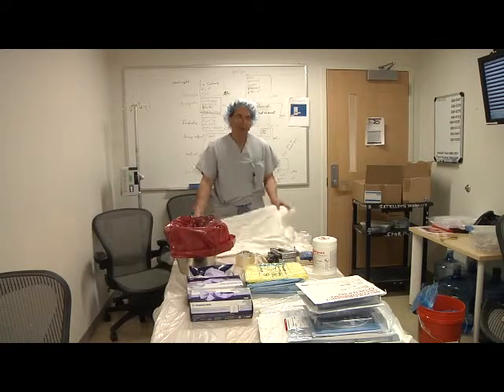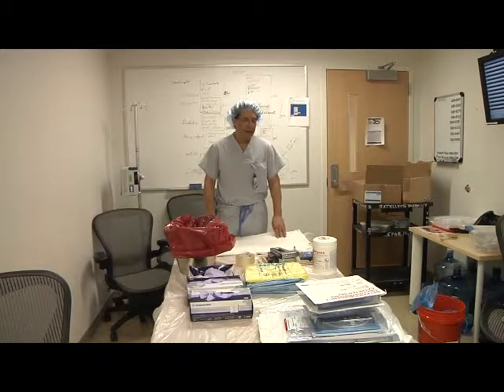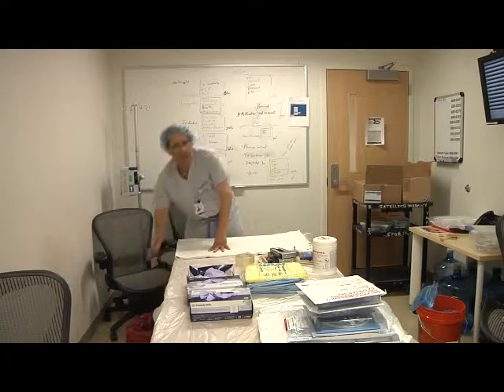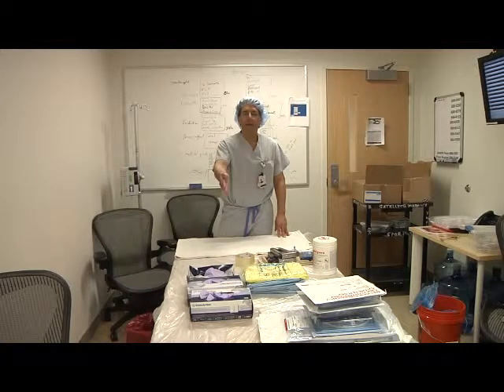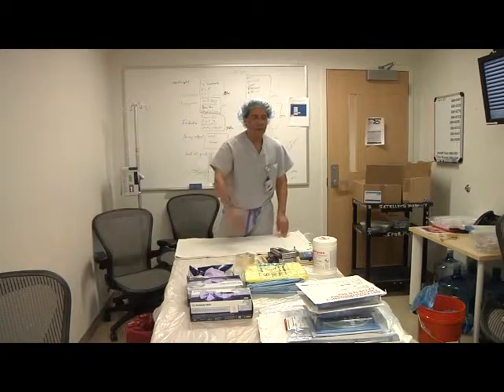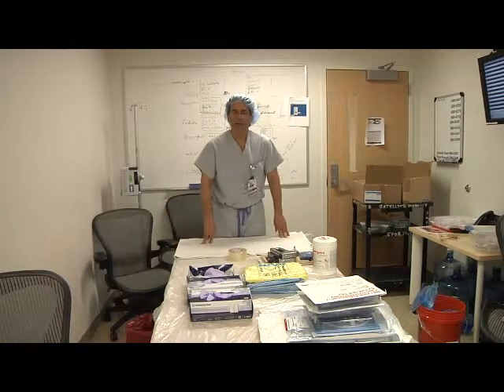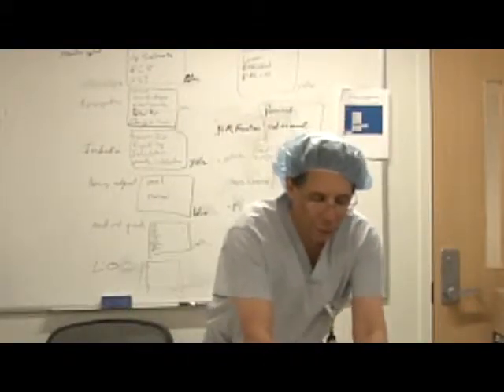You might want some kind of absorbent towel or blanket when you're first working with the swine tracheas because they can be quite wet. A regulated waste bucket is a good idea to have to dispose of the swine tracheas. We have small, medium, and large gloves. We have cover gowns for those who don't come in scrubs, some antiseptic wipes, and also I failed to mention some tape which was used to secure the plastic onto the table. The AOD setup for the swine trachea lab uses a wooden board.